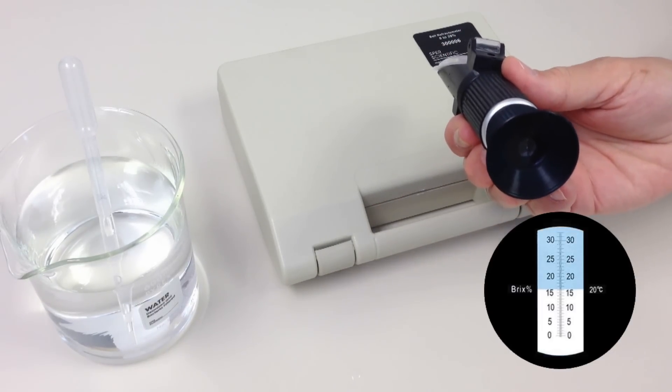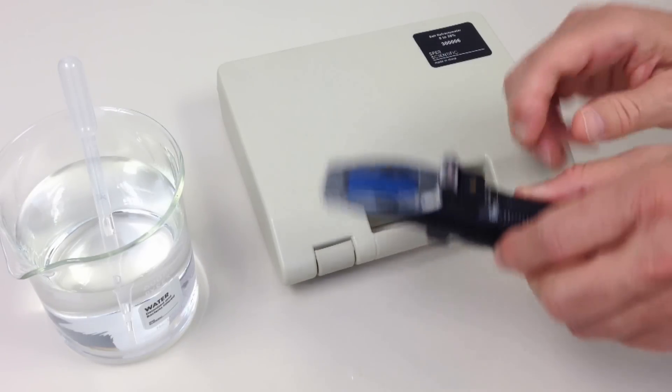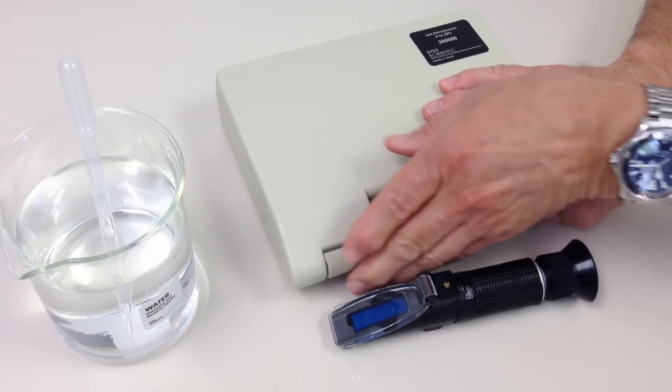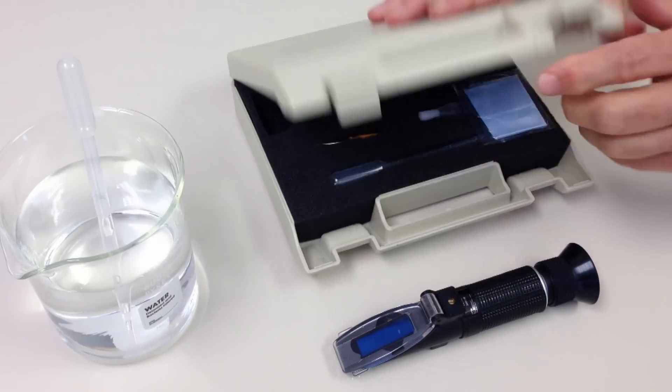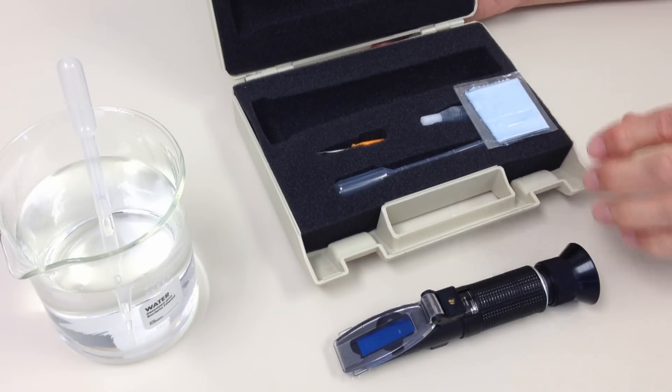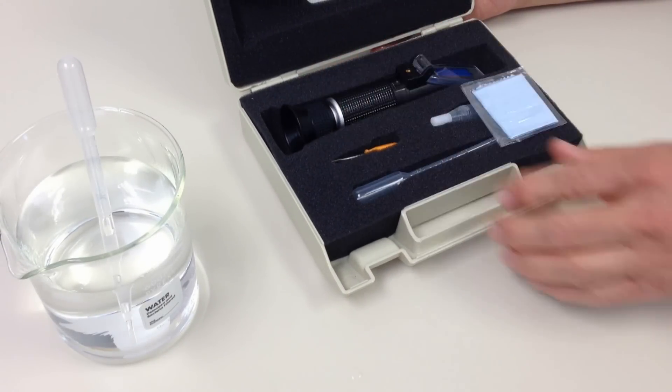Spear Scientific Refractometers come with all the accessories necessary for immediate use, including calibration tools and solutions, full instructions, transfer pipette and a protective foam lined case.